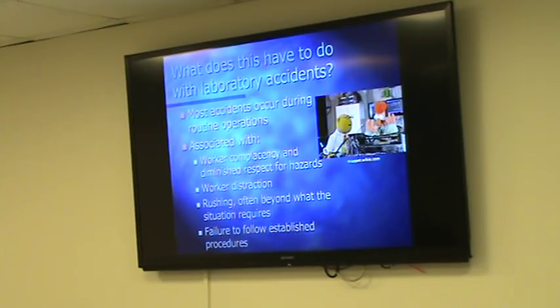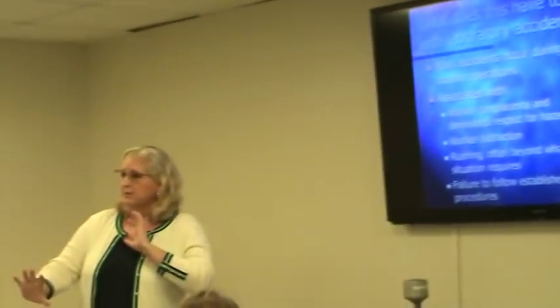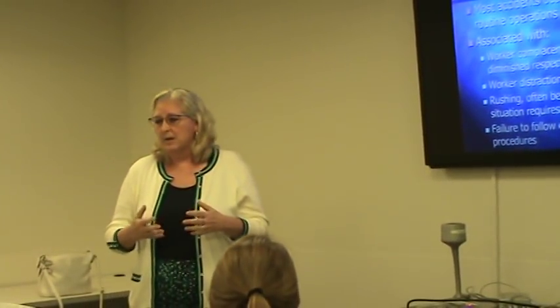Most accidents in the laboratory really do happen during routine operations when people are either rushing or distracted. They've lost their fear of the idea that, oh my gosh, that might be blood from an AIDS patient. My son, God love his heart, is freaked out by all things medical, and the thought of having HIV positive blood in front of him sends him into palpitations. Yeah, I lost that, if I ever had it, years and years ago.